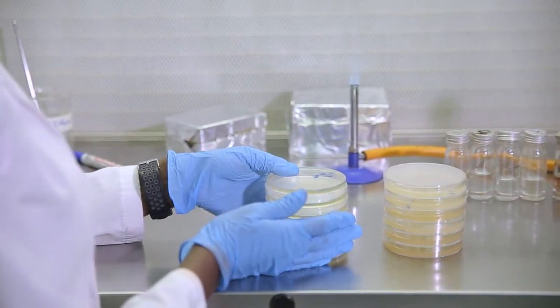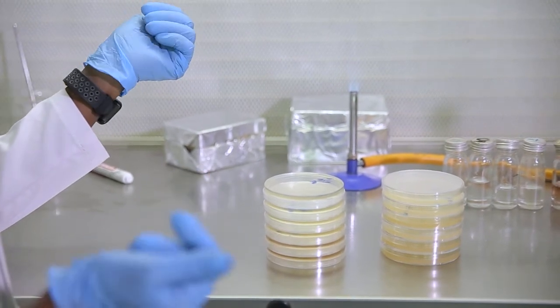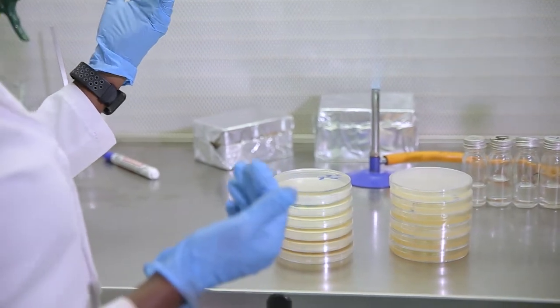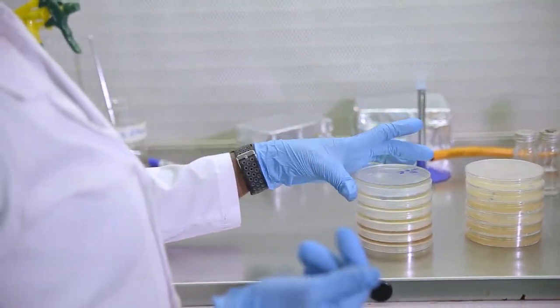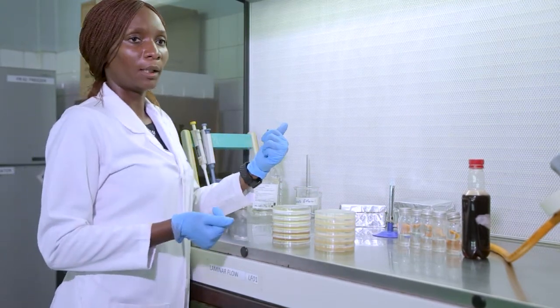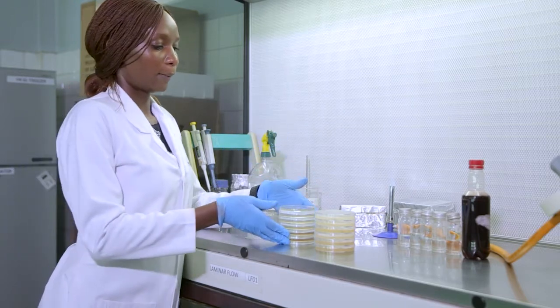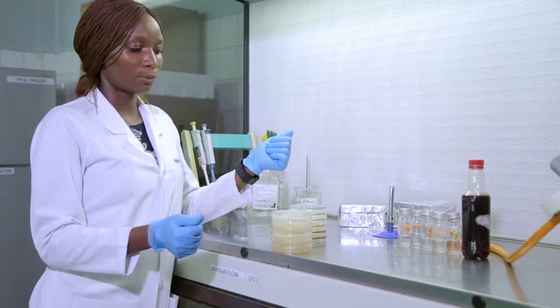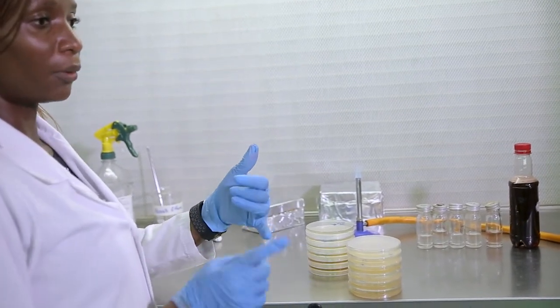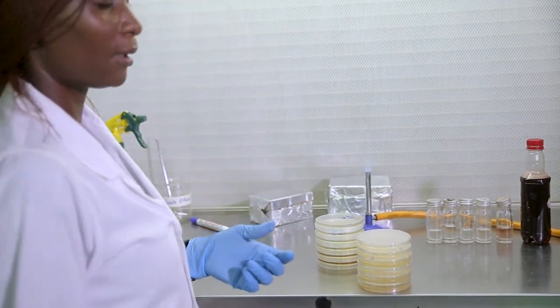The TPC plates will be incubated at 30 degrees for 24 hours, but it could go up to 72 hours depending on the growth. If after 24 hours the colonies are there but too small, we can give them an additional 18 to 24 hours or even an additional 48 hours. For the yeasts and molds, we are going to incubate at 30 degrees for 72 hours. Alternatively, you could incubate at room temperature, which is about 25 degrees, for 5 to 7 days.